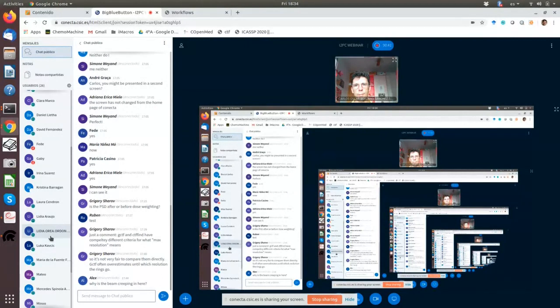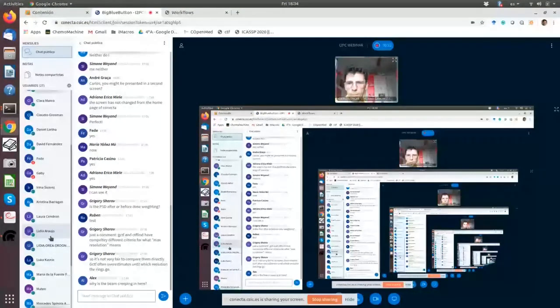Maybe I can just ask a question. It's a bit out of the topic, I think. Sure. I run a 3D classification job on Scipion, but with Relion. And it's interesting that in the log file I get an error which says XMIPP error. What does that mean then? And it is using Relion. Yeah, very likely it is. I got confused. I don't even have XMIPP in the workflow.